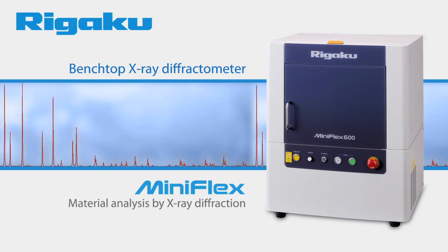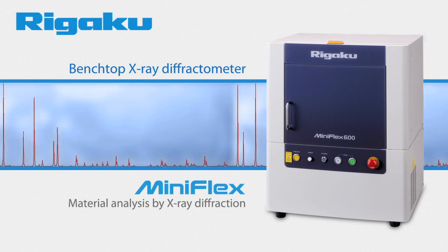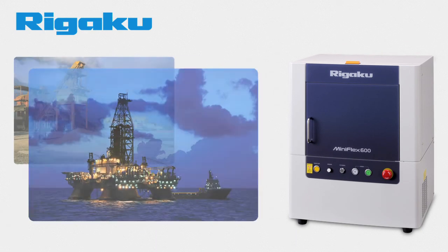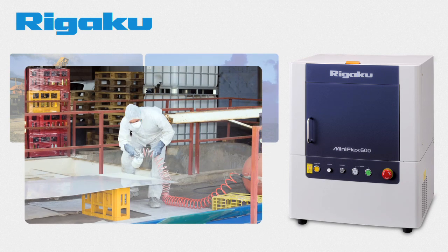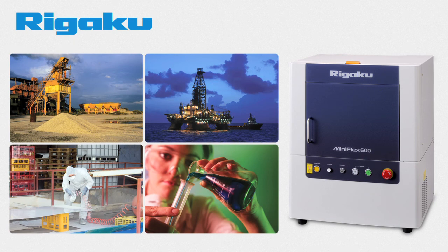X-ray diffraction, XRD, is a powerful and well-established technique for analyzing materials. It is used in industries as diverse as cement, catalysis, petroleum, batteries, and pharmaceuticals where companies rely on XRD to characterize materials from basic research to quality control.